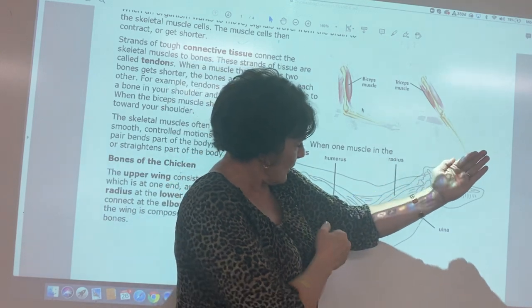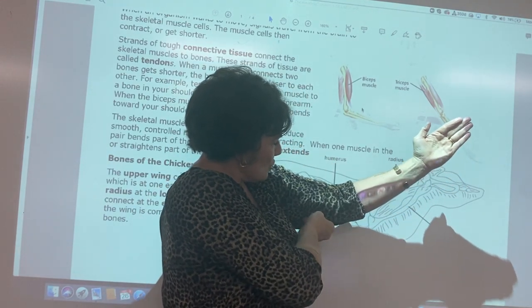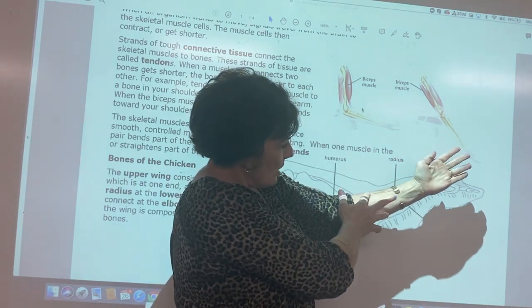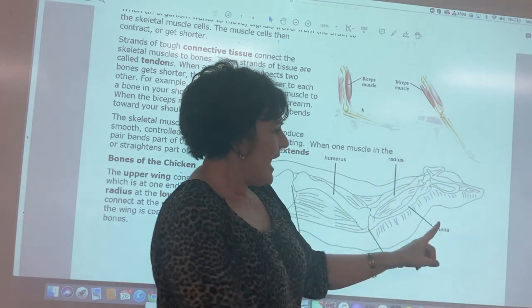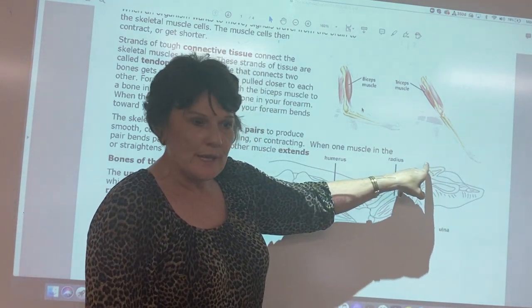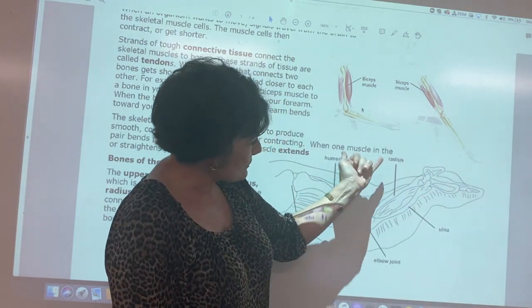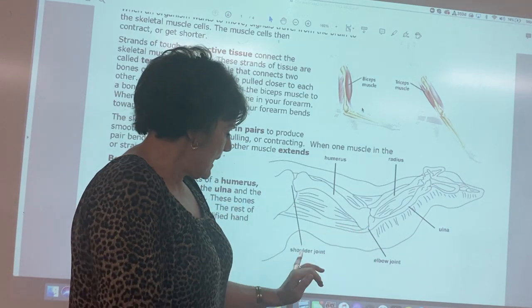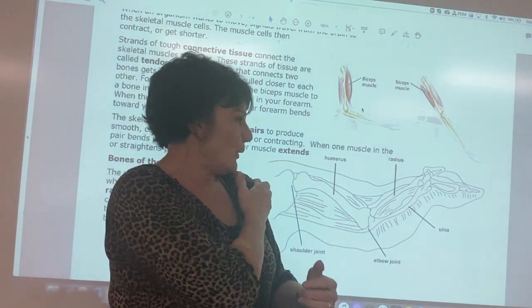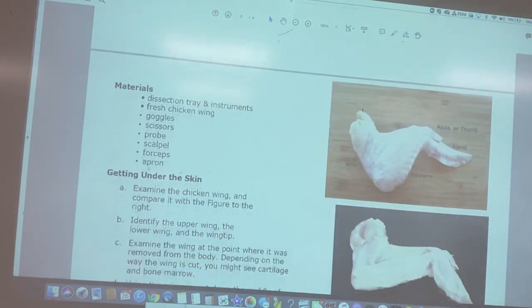The chicken also has both of those muscles. Here's the humerus with the bicep and tricep, the forearm with the radius and ulna, and the hand. The chicken wing even has a thumb on it. The elbow is here and up here would be the shoulder joint — very similar to ours.